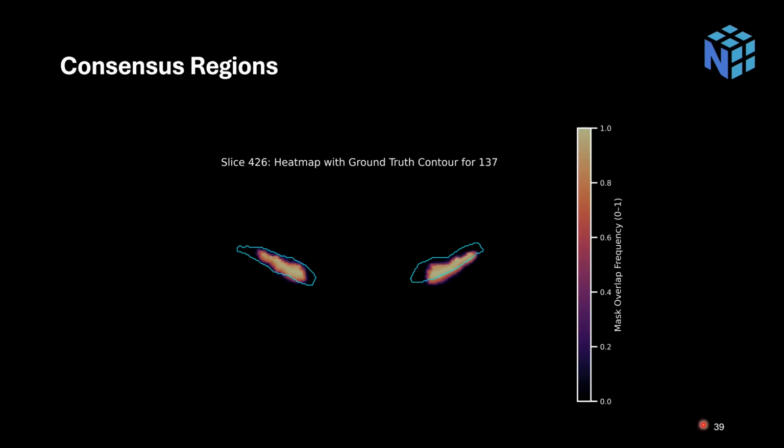And so you can see here the light blue is what was annotated as the ground truth. But again, I do want to highlight that there is also a lot of uncertainty in that ground truth itself. You can see the regions are sort of getting us closer to what we think is the truth. This just gave us a way to embrace the uncertainty rather than ignoring it.